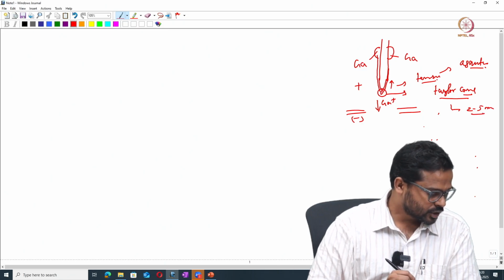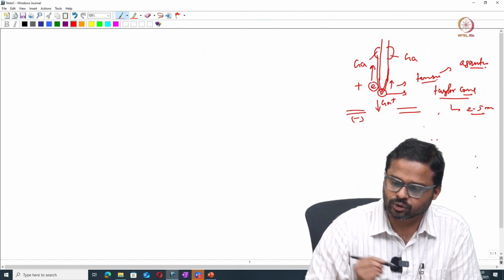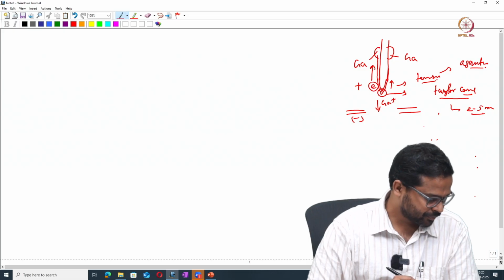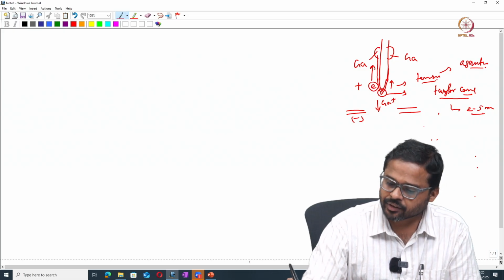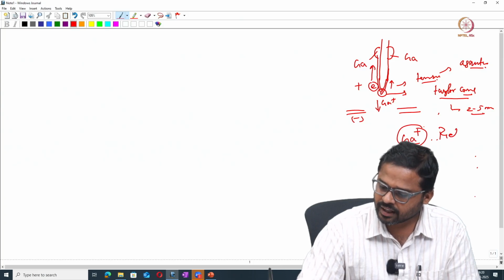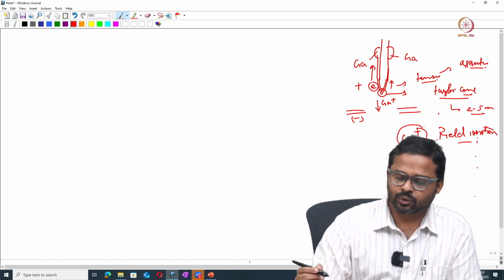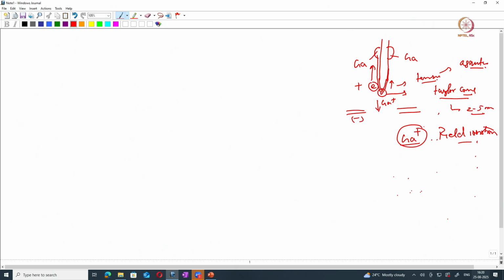radius, okay. Then the electrons from the gallium get tunneled through the tungsten tip, and this involves the field ionization of the gallium to gallium plus ions. This is called field ionization. Then due to the electric field near the tungsten tip, in front of the Taylor cone, there will be a field evaporation. These ions are accelerated towards the column. So this is your FIB column, correct. These are the extractor plates, right.